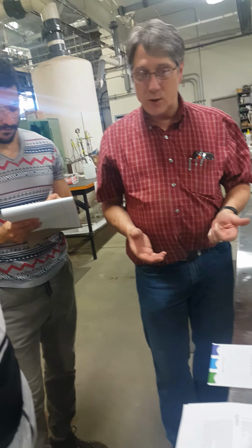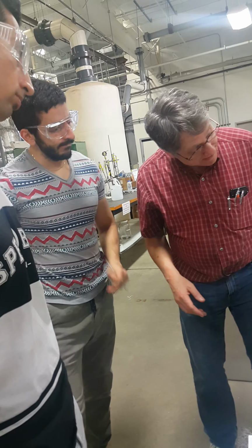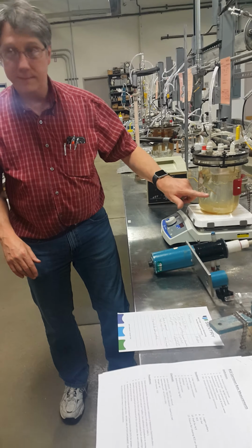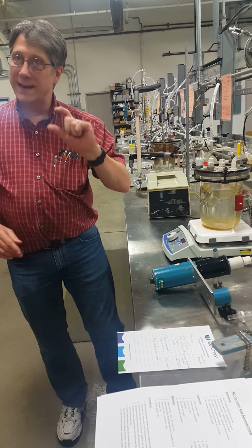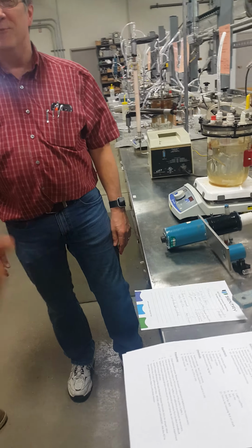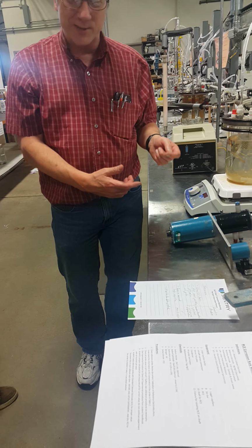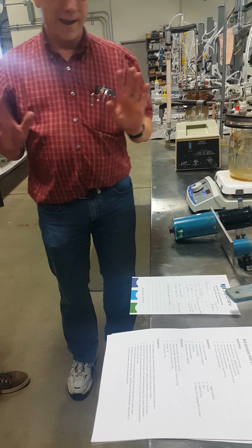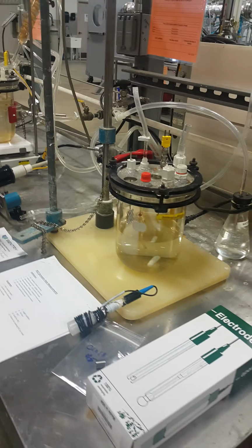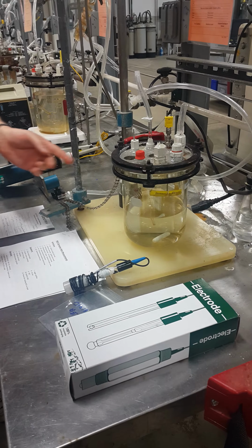I actually had someone having troubles, and I came out here and looked, and we could actually see, if you got in the right light, a line where you had a denser solution, and it was like, wait, this can't be real. I've never seen this before. So we put a stir bar in and we stirred it, and the problem went away. So you need a stir bar, so that's one thing you've got to clean and get fixed up.